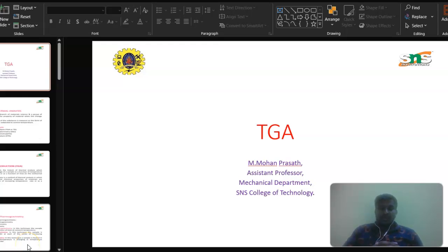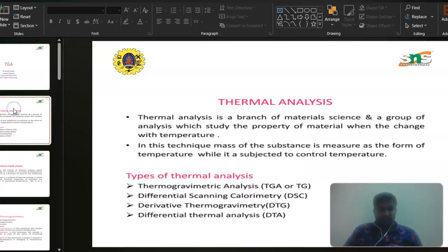Hi. Good morning. In this seminar, we are going to discuss TGA and the different types of TGA. First, we will see about thermal analysis.